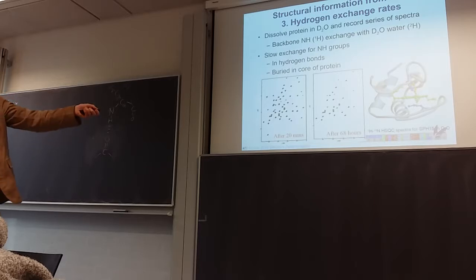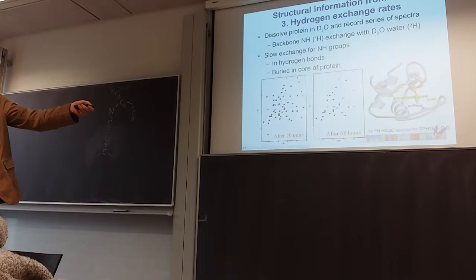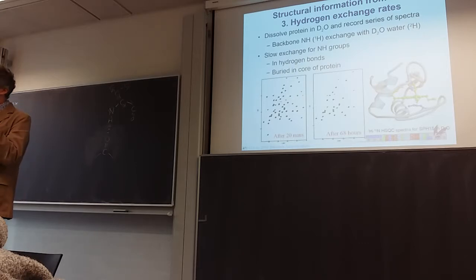You measure all the short distances that go with the helical conformations here. You measure the short distances between the two adjacent helices, and so on. You measure these short distances between this part that's still flexible. So the overall structure, the average structure that you have in your sample has not changed, but you've lost all the signal on your amide protons, your nitrogen protons in the backbone. Why is that? How can you explain that?